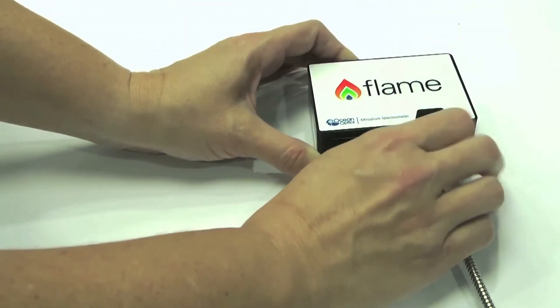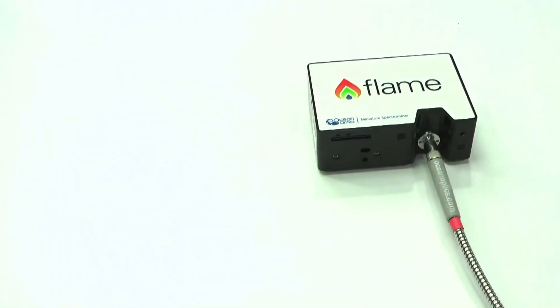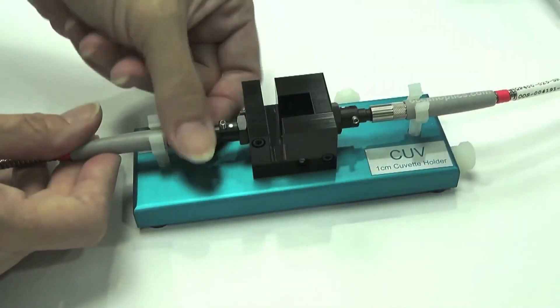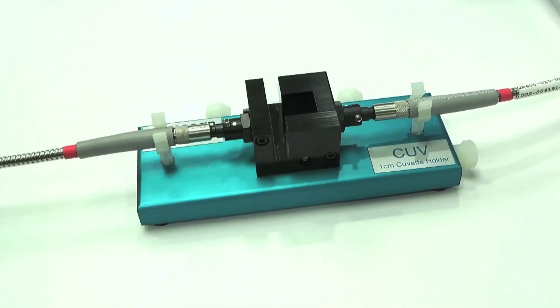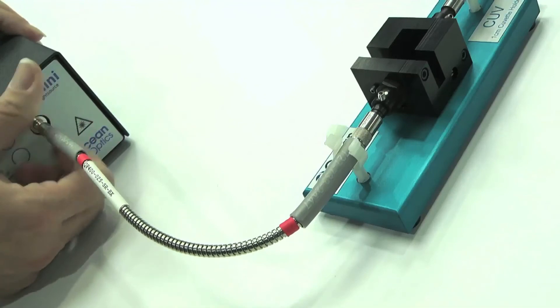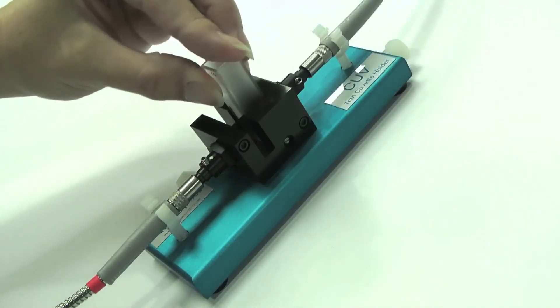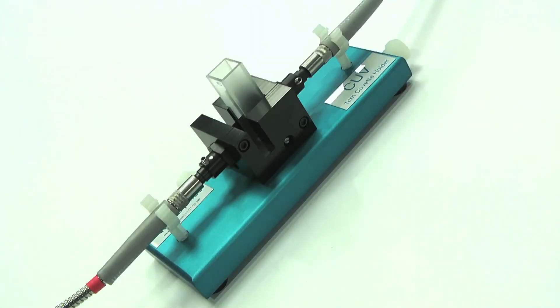To set up your absorbance measurement, simply connect the two fibres — one from your Flame spectrometer to your cuvette holder, and the other fibre from the cuvette holder to your light source. You can now place your sample into the cuvette holder to start taking measurements.